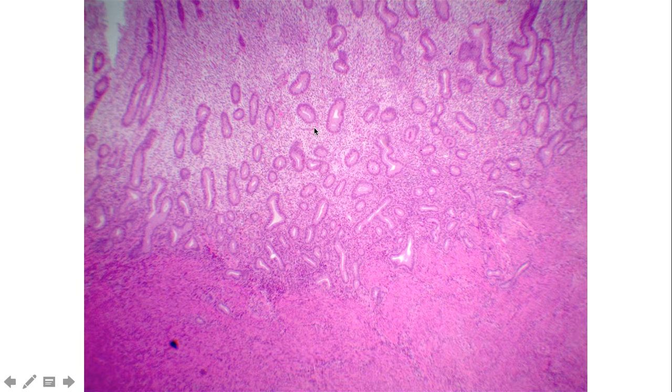And we're asking you to distinguish between these two regions. There's the stratum functionalis and the stratum basalis. And really, it's hard to see a distinct line between these. But if you were to have a pointer asking you about this kind of basement layer, so here, right here, this is the transition out of the endometrium into the smooth muscle layer or the myometrium. And so the part of the endometrium next to the myometrium, where this arrow is, this is going to be referred to as the stratum basalis.